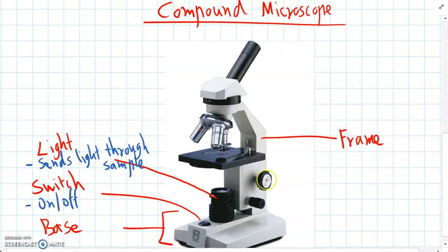And attached to the frame we've got a couple of other features. We've got two knobs here. Sometimes they're joined into one. But here the bigger one, this is the coarse focus.